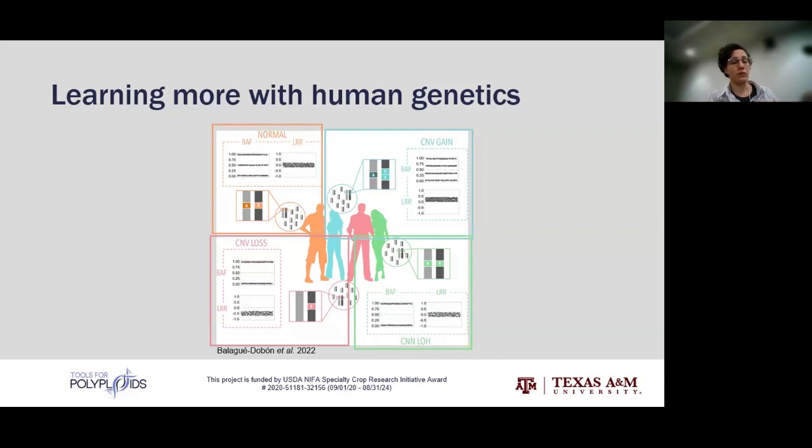So this measurement is really important to differentiate these 2 situations, the loss of heterozygosity and the deletion. Without this measurement, I cannot even think about starting to research CNVs, because I cannot differentiate what's homozygous and what's a deletion.